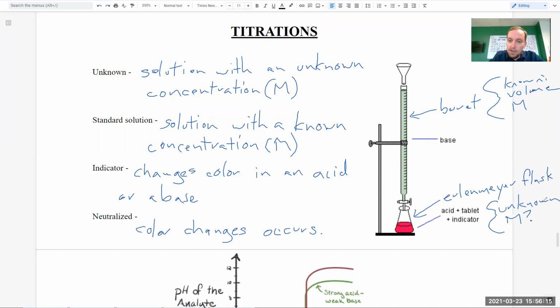So, and of course, this right here is called a clamp. It just holds it all in place so that we're very careful. Now, what we have here is a little valve, also called a stopcock. The valve we're going to open and close very gently. This is where it kind of goes from being a science to an art.